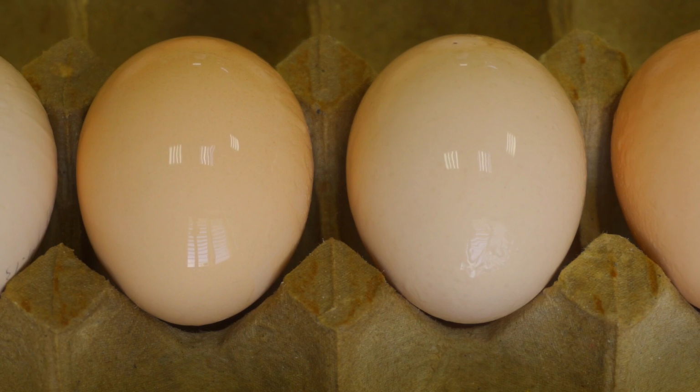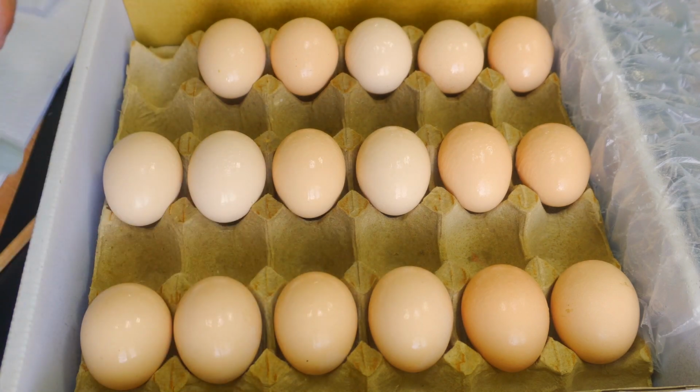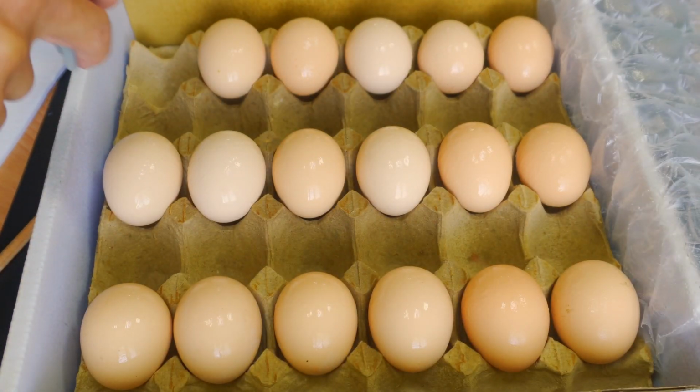Makes sense. And then into the incubator, what are the conditions? They're kept pretty warm, around 37.5 degrees Celsius. But the timing when you actually take the embryos out, that's super critical. It's not just a set number of days.